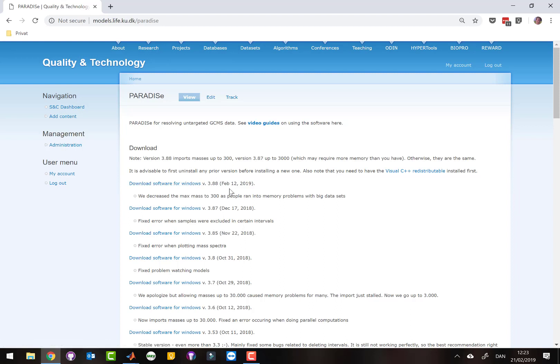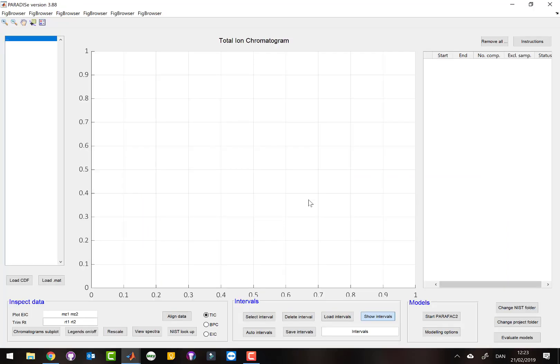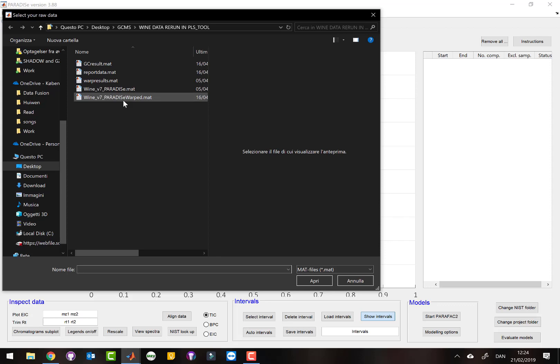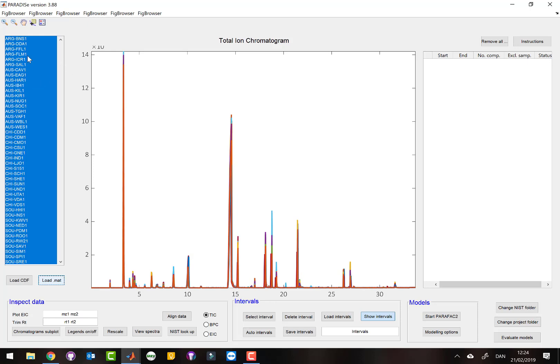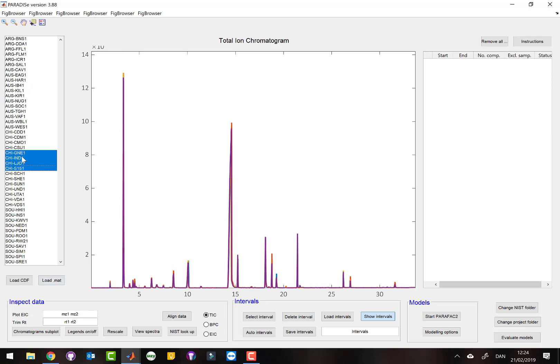Once you have downloaded and installed the software you're ready to go, and this is what it looks like. We start by importing data, which could be either CDF files from the software, or if you've already imported the data once, you can load it as a so-called mat file, which is a MATLAB file — that's usually faster. I have a data set here and I can load the whole data set very easily.